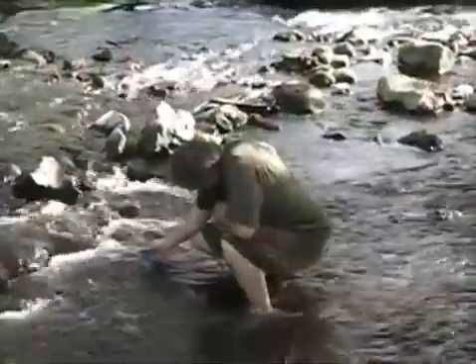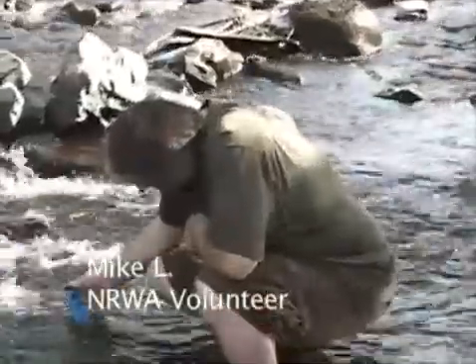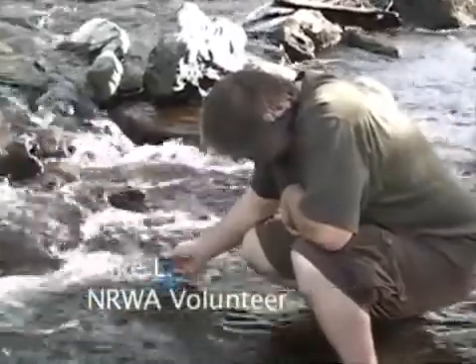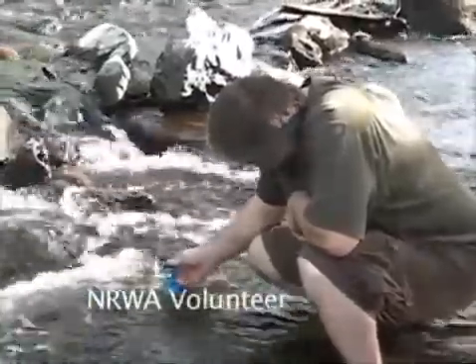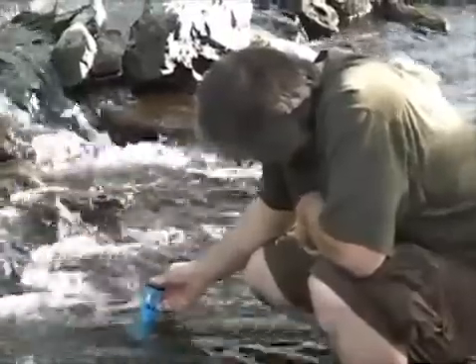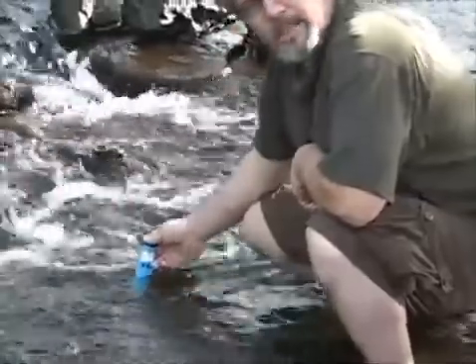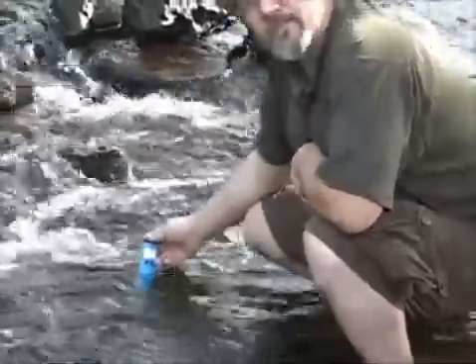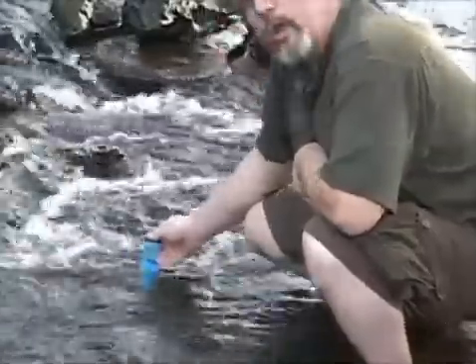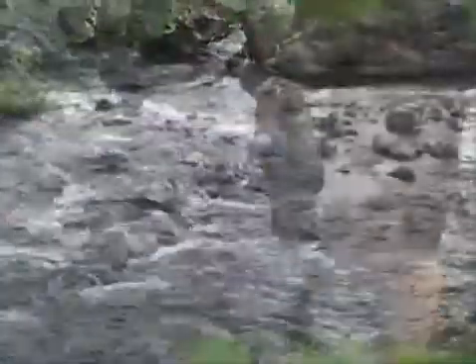Yeah, we're doing conductivity and temperature simultaneously with the special instrument, which takes a few seconds to even out. And one of the things is that you really need to be in the water. In the water safely. The temperature is 16.5 degrees centigrade. I'll write that down. And 194. And 194 for the conductivity.